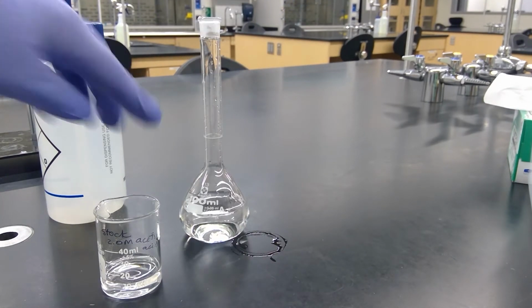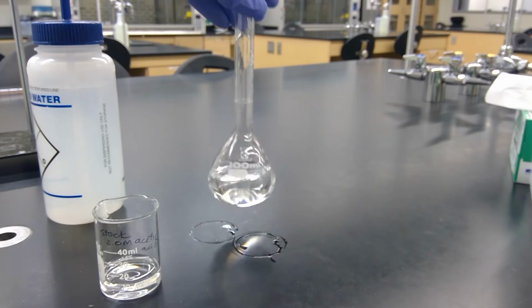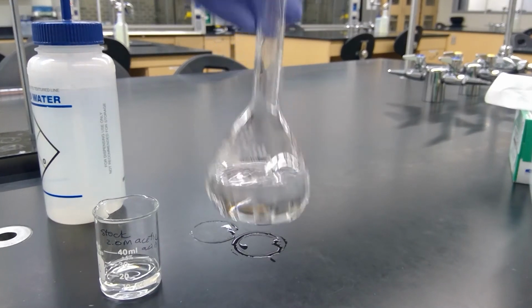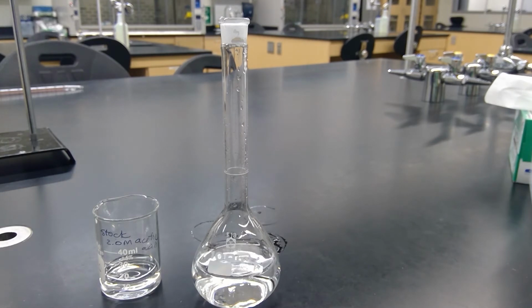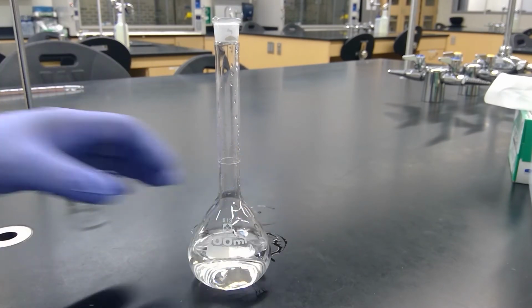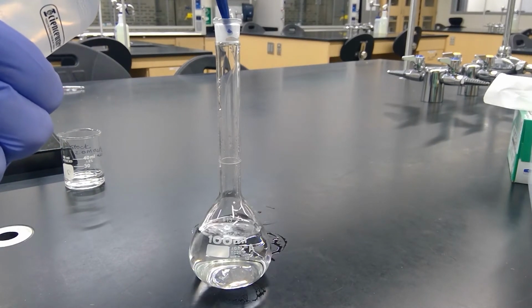And then you'll want to fill, you see the line right here? That's calibrated to be exactly 100 mils, plus or minus 0.08 mils. So they're pretty exact. And you don't want to go above this, so it's better to be more cautious when you're filling it. So I'll just use the squeeze bottle.